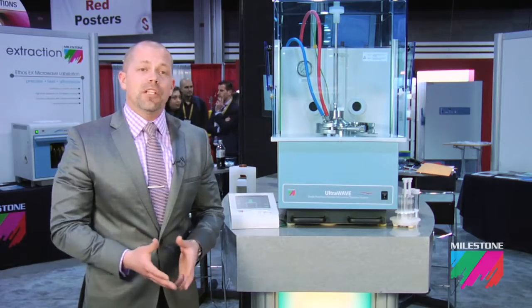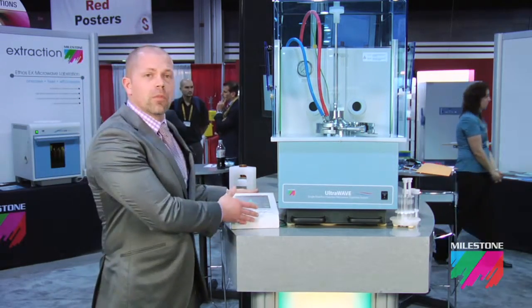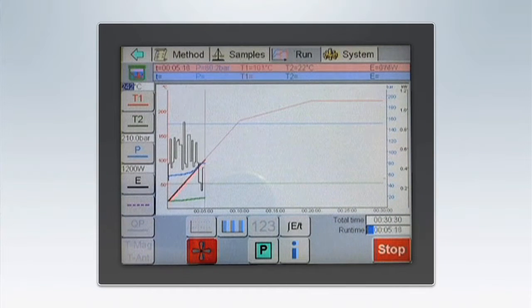We pre-pressurize the system with nitrogen, which acts as a cap on the individual digestion vessels, at which time we start the microwave program using the external controller. Typical digestion times are approximately 40 minutes.